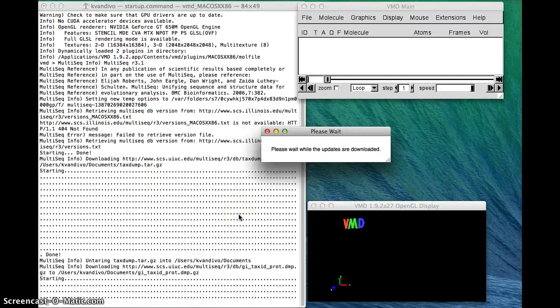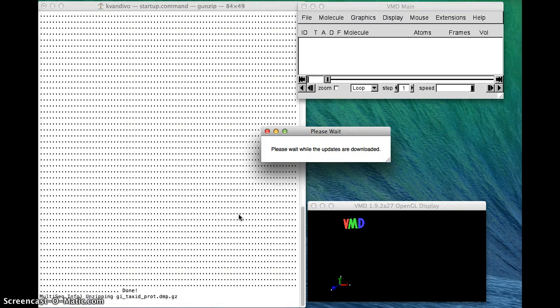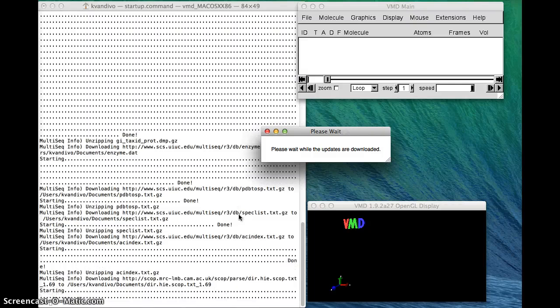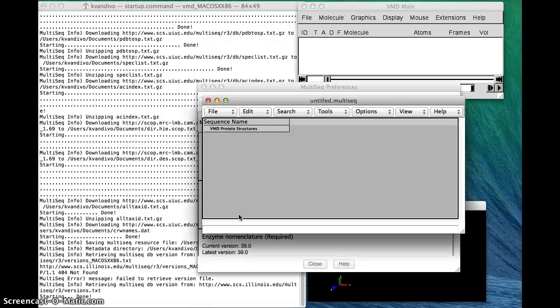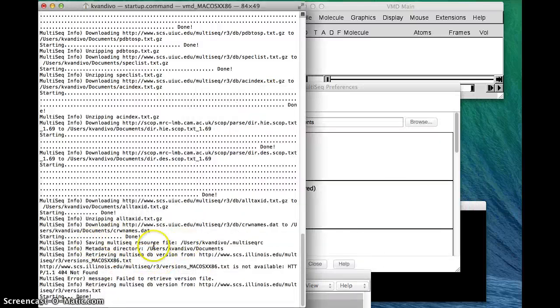It's going to download very, very quickly on my machine because I have a very fast connection to where the files are located. But you can expect that it's going to run quite a bit slower depending on where you are and how many people are trying to access the file at the same time from the server, and several other factors.